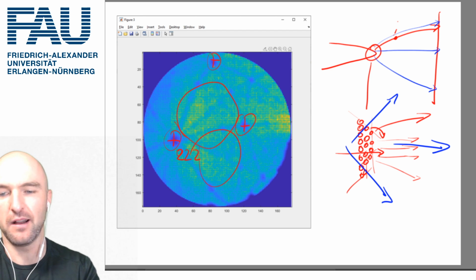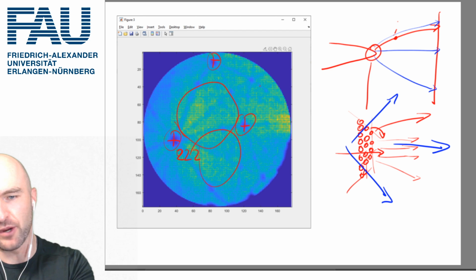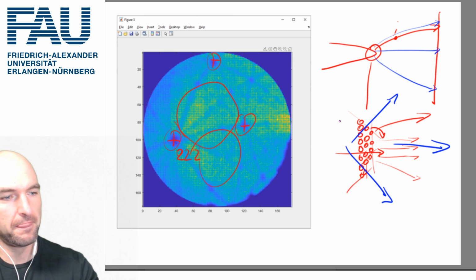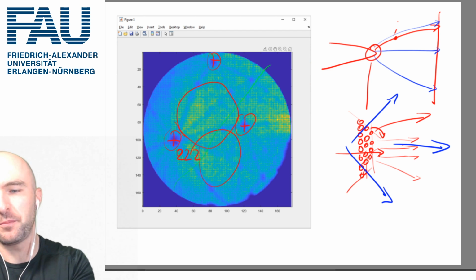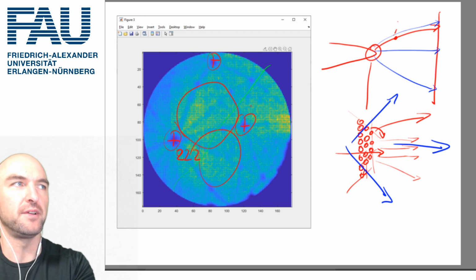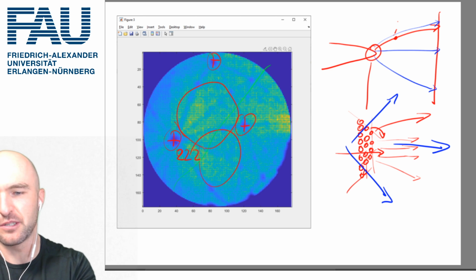Also, this is obviously one crystal because there's no interruption to any of those zone lines or any of those poles, but we might have a grain boundary going through here. Then we would be able to see some pole structure here and some other pole structure here, because the crystals would be tilted with respect to each other. And this is something we can see in a field desorption map very easily. And this is why it's interesting to plot those.